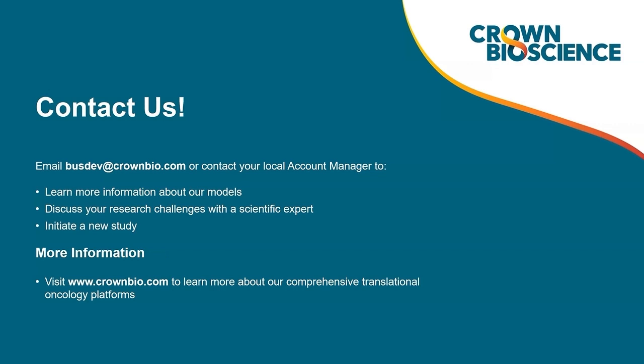And the final question that we have here for the session is, what are the main methods used in the run and separate strategy? In our study, we evaluated three types of run and separate protocols. The first one is the full peptide approach. This method involves searching both common and species-unique peptides against the unified human and mouse protein database.